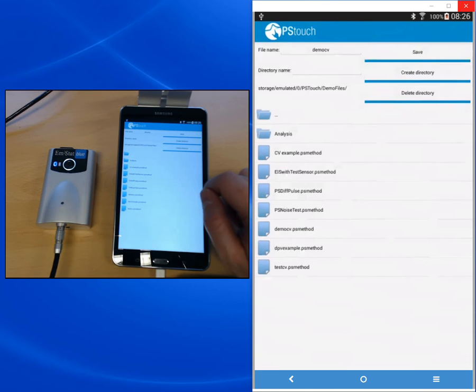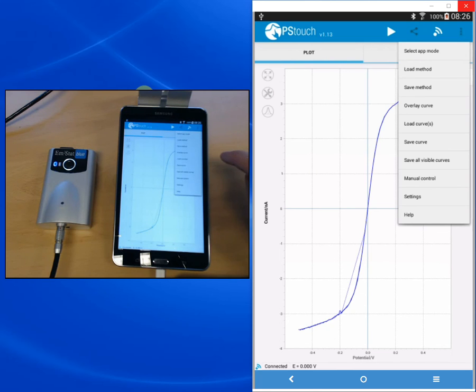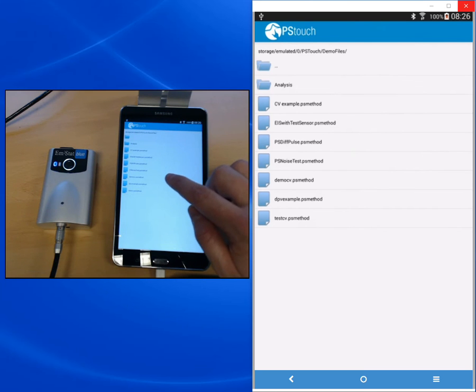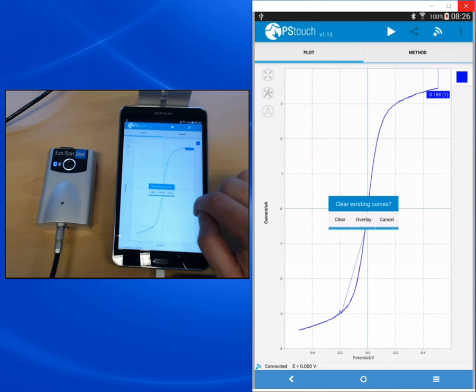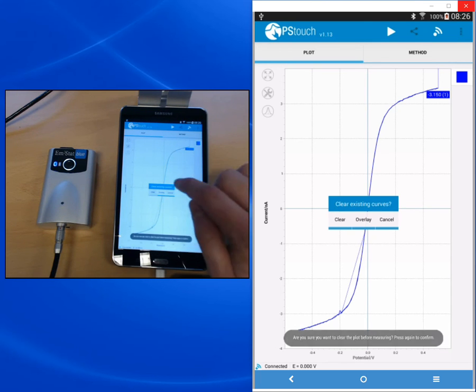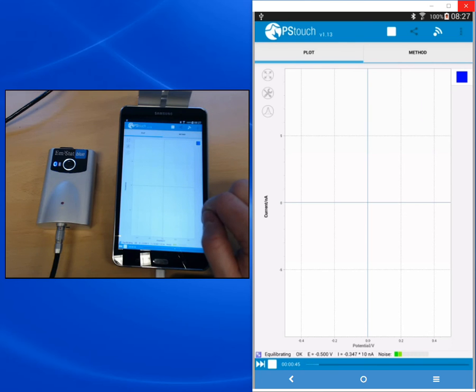If you are using the same methods over and over again, you can load a method by pressing Load Method and choosing a method file from the list. For example, we can choose the PS Differential Pulse measurement, which is often used as a reference measurement to check if the device is functioning properly. When you start a measurement while there's still a measurement on screen, you can choose to clear, overlay, or cancel. If you clear it, the curve will vanish and you'll be asked to confirm to prevent data loss. When you overlay, the new curve is shown in the same plot as the old one.